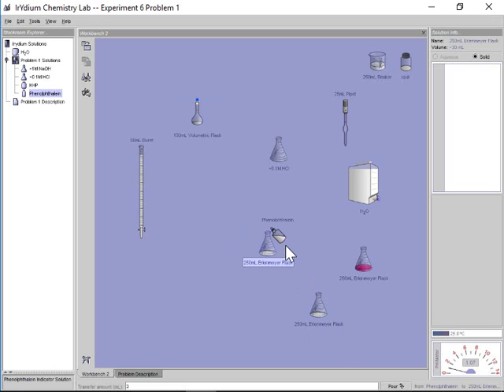Make sure you drop in your phenolphthalein into both of those there. We're deciding to test 25 of our unknown acid. And now I'm going to be ready to drop in my base because I know roughly it's going to be 32.43. I should be safe here dropping in about 30 mils. I'm going to make sure that I've tabulated down my starting number. I don't want to have to redo that part.